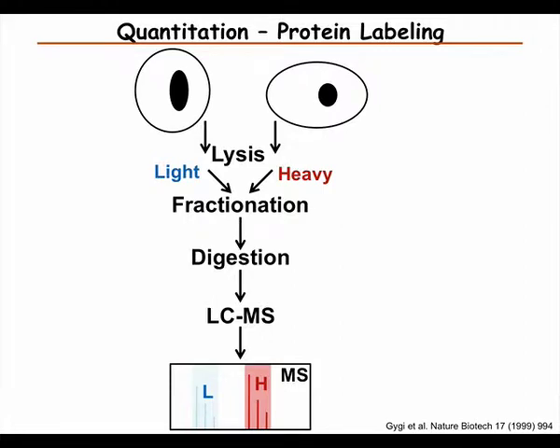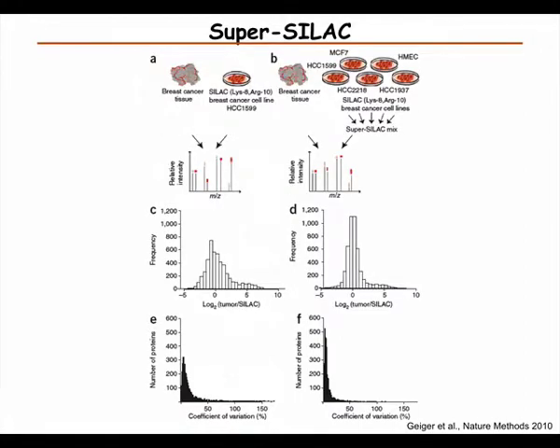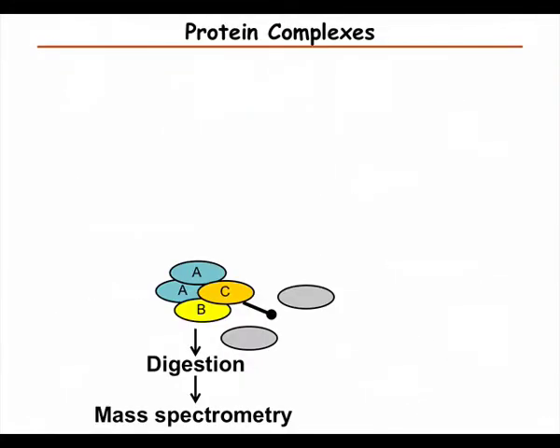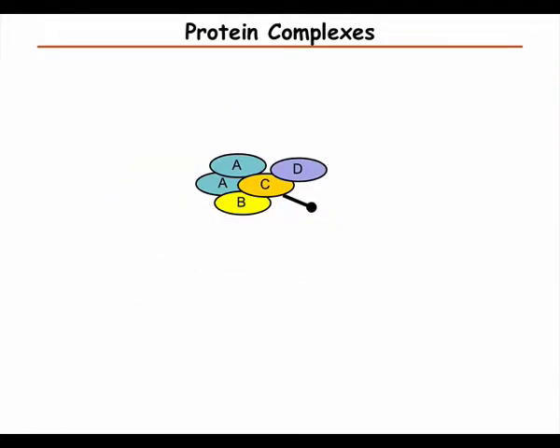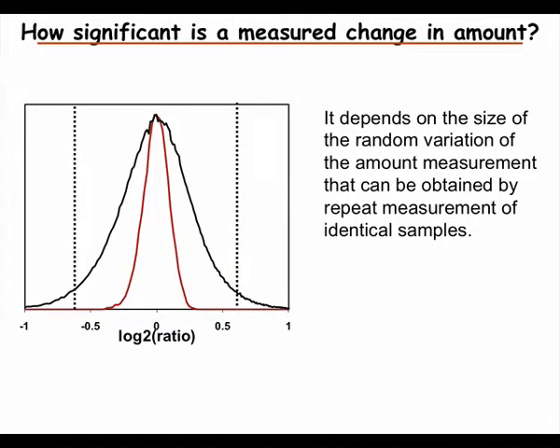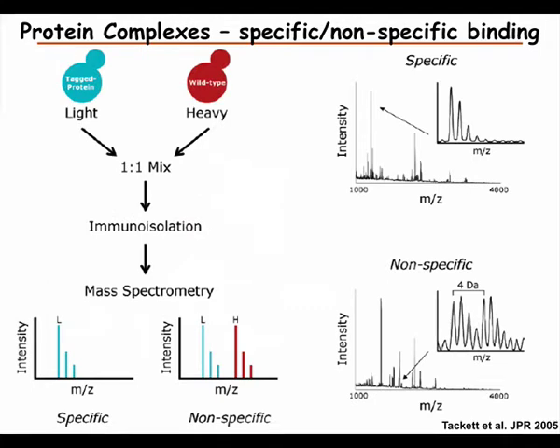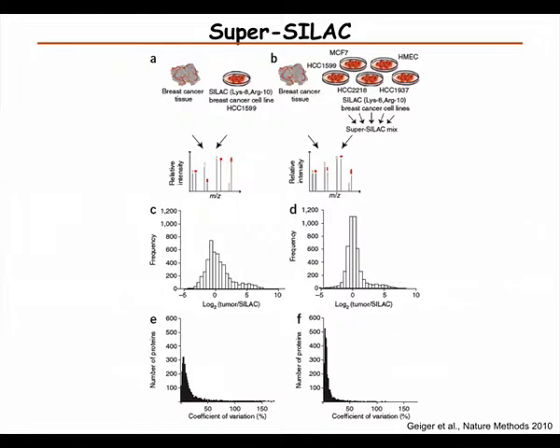Sorry, I didn't understand the SILAC. I mean, this is the amino acid? Yeah, so sorry. SILAC is the metabolic labeling, where you add heavy amino acids. I mean, what is the difference? Why does it work? What is the difference between that and the heavy labeling we couldn't use, as you said?